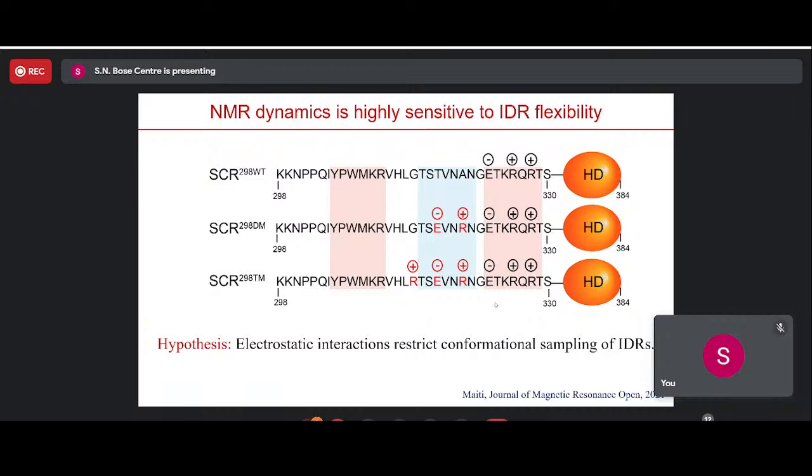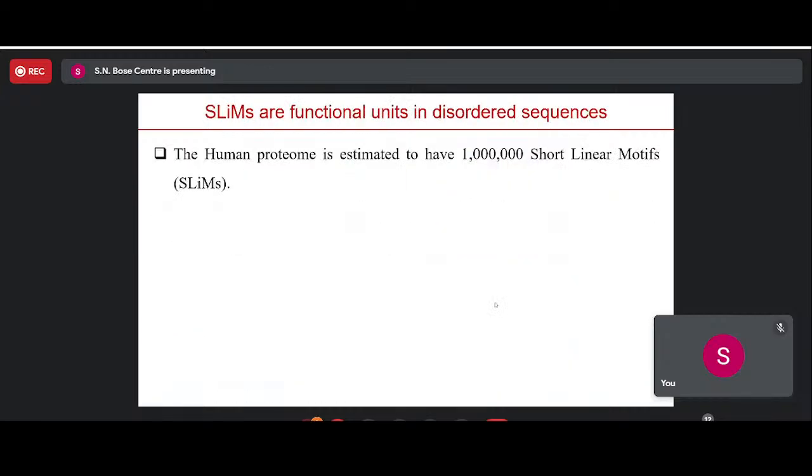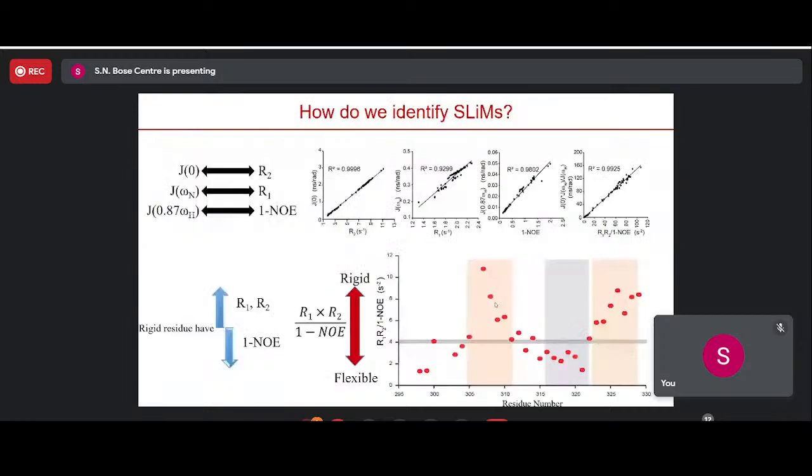Question? Yeah. For correlating with J, NOE, you have one like 3 factor kind of 0.8 something. Sorry, let me go to that. This one? Yeah. Oh, this 0.87. So what is that? Okay, so yes, sorry, I actually sort of glossed over that.